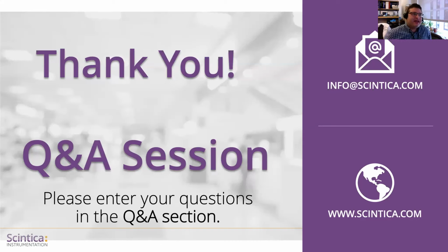Absolutely. So I think, like I said, this was a very short pilot study to show that we could even just do it without killing the mice, honestly. And the dose that was reported in the literature was 10 milligram per kilogram of body weight. Here, for the pilot, I had to use 3 because this compound literally cost thousands of dollars. Because we didn't have the funding at the time, I could only do the pilot with this. In order to do it on at least 3 mice, I had to do a suboptimal dose.